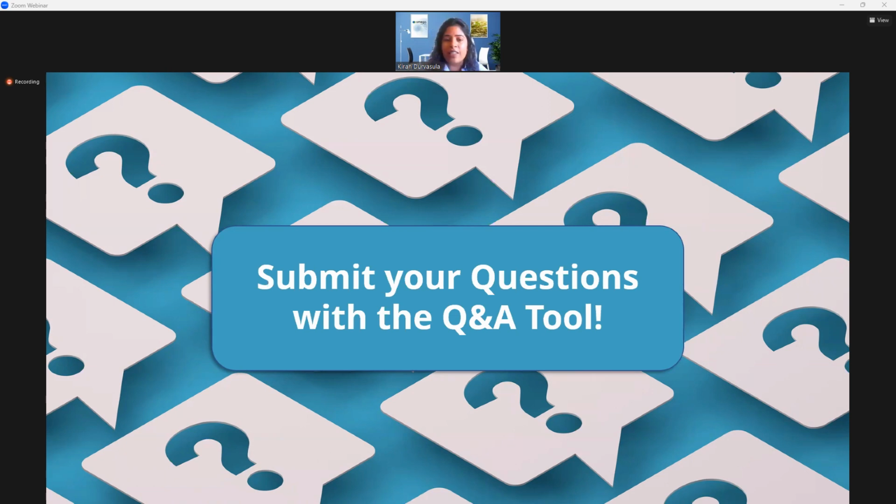Yeah, I can take that question. Thank you everybody for attending our webinar. Like we've presented in the webinar, if you look at the pictorial for the eDNA, we did mention a lot more sample types like biofilm, sediment. So yes, this kit can definitely be used for more than one sample type. However, the pre-processing steps could vary. So do connect with our team so that we can give you the right product recommendation and protocol recommendation.